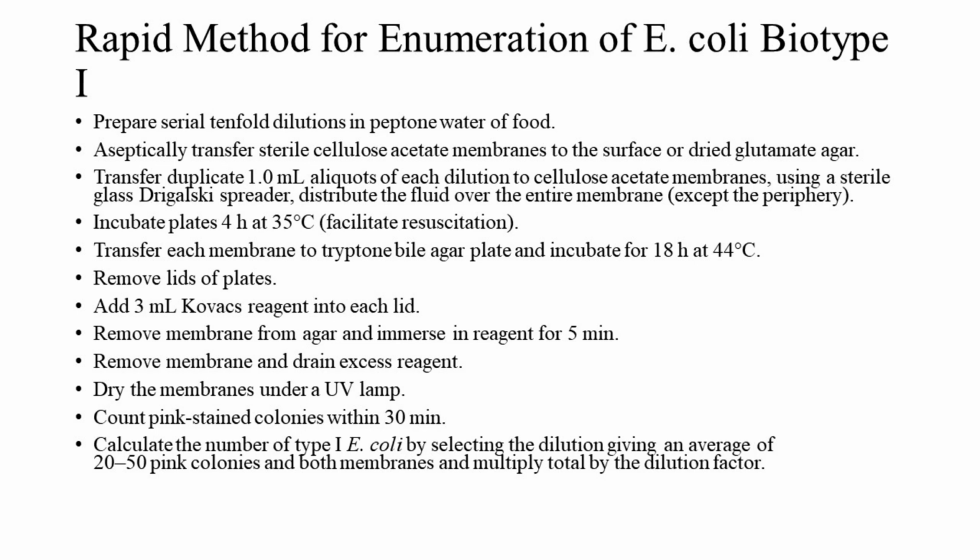Rapid method for enumeration of E. coli Biotype I. Prepare 10-fold serial dilutions in peptone water of food. Aseptically transfer sterile cellulose acetate membranes to the surface of dried glutamate agar.